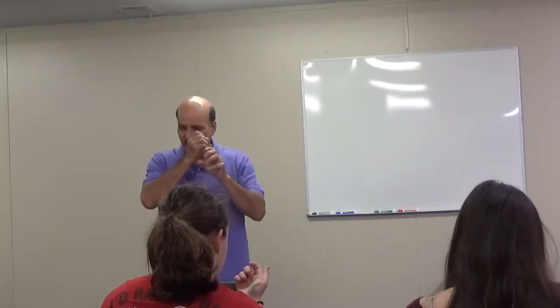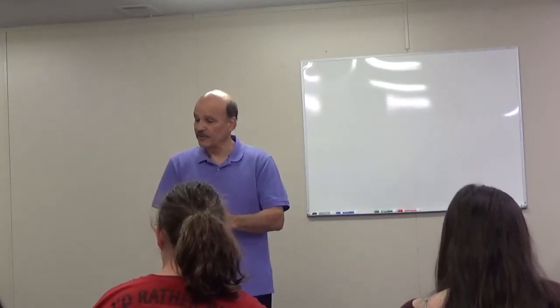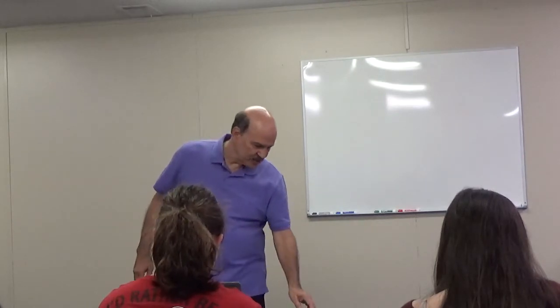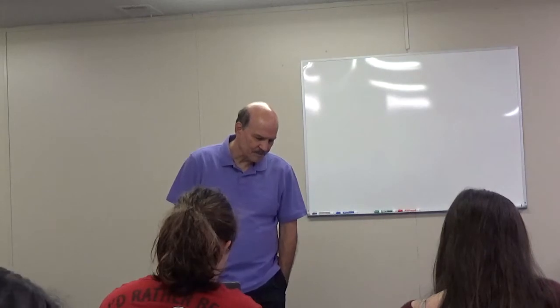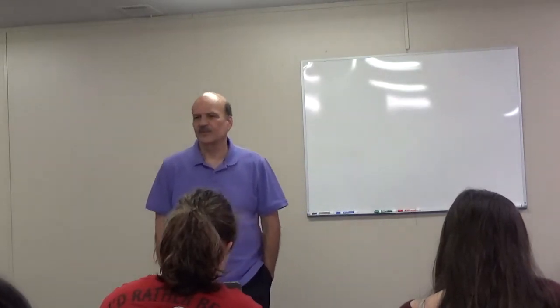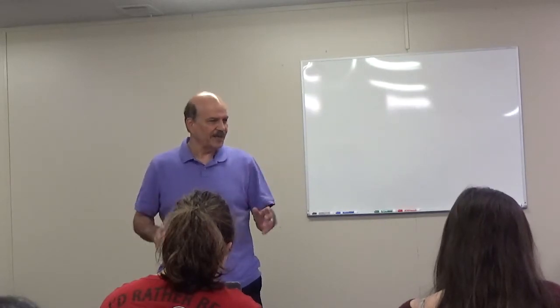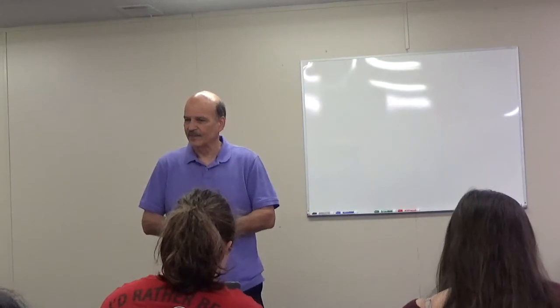The eyepiece is what you look through. The objective lens is the lens that's closer to the object you're viewing. The product of the two gives you the magnification. So if you missed question 2, which had to do with the total magnification, you need to explain that and then show your work. So what I mean is explain and show the work if you want me to give you half the points back that you missed, all right?